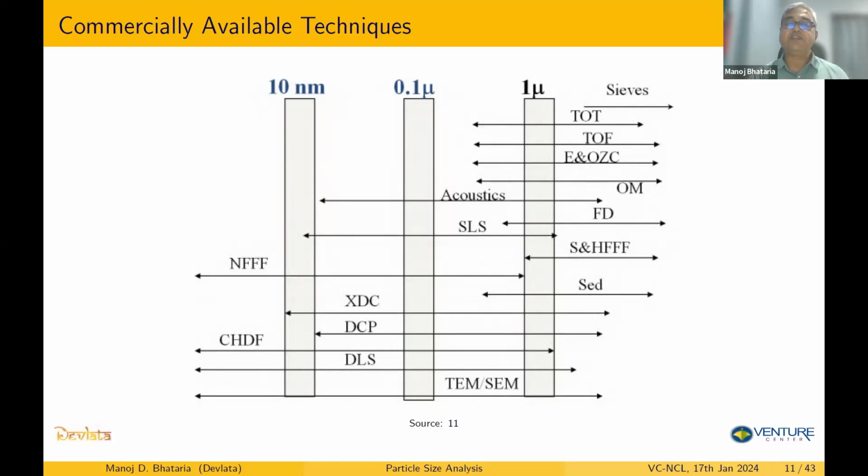Now, one technique may not be sufficient for your analysis. You'll have to choose the right technique for your kind of particles, because industry-wise, the size range that you will encounter in a particular industry would be varied. So it would be best if you decide which particular instrument is suitable for your kind of analysis. There is no single instrument which will take care of all the requirements.